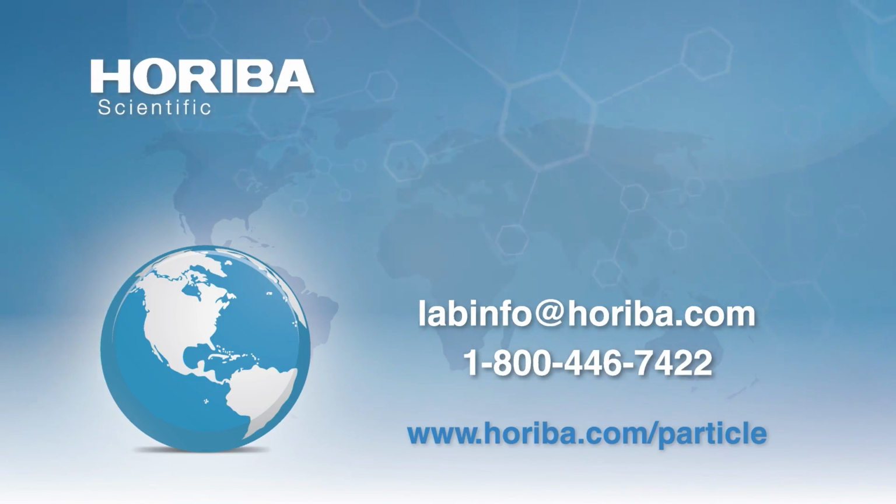Yeah, I think that's a good point, Julie, because there what we're doing is what we talked about earlier, measuring Brownian motion. We're no longer trying to sediment anything. We just watch the particles move, and from the speed of their movement, we deduce the size. So you're right, you would get concentration plus particle size, both from one instrument, which you would not get from a centrifuge.